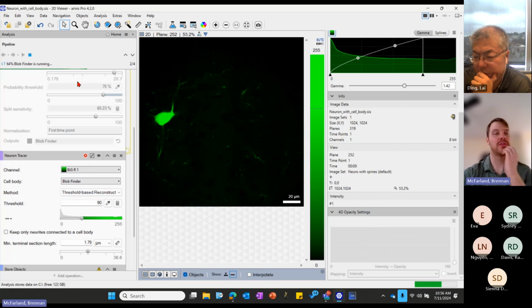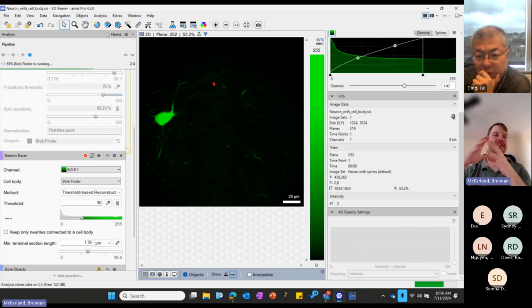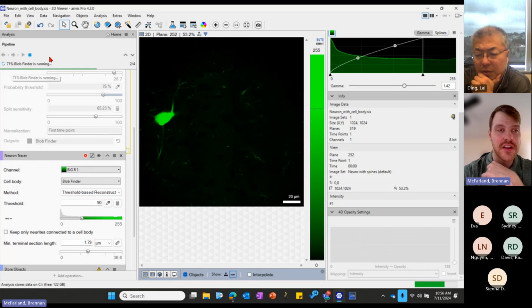Sometimes for this percentage it's running, the math is determining what this is, but sometimes it goes slower just because it's doing the math. And then towards the later half of it, it's just doing a rendering. So you can see it's now starting to move a little bit faster. Point being, there are certain chunks of this pipeline where it may just speed up and finish really quickly, which is what I'm hoping will happen here.